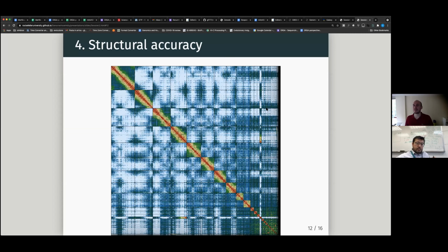You want to take it? I mean, you want to present this, Olivier? Sure. So this is the Hi-C plots. I don't know if you remember Hi-C. Hi-C is the cross-linking of DNA, and then you sequence the junctions of the cross-link, right? After you map it back to the genome, you expect to see most of the fragments map on contiguous sequences.